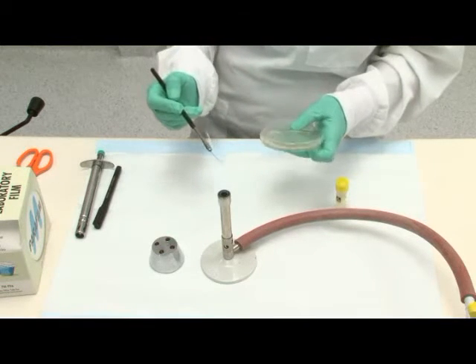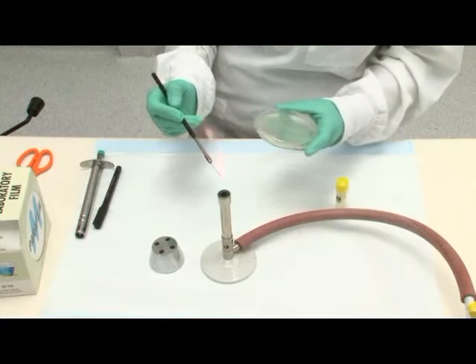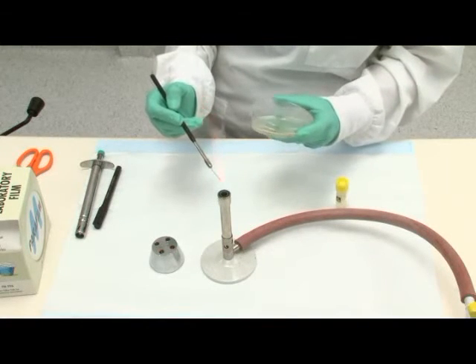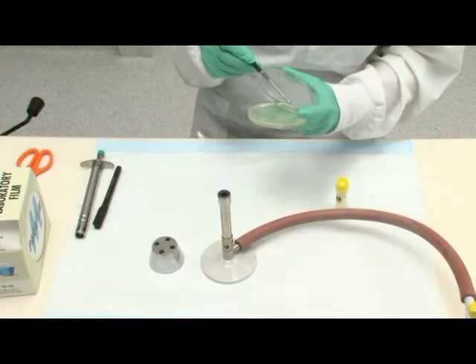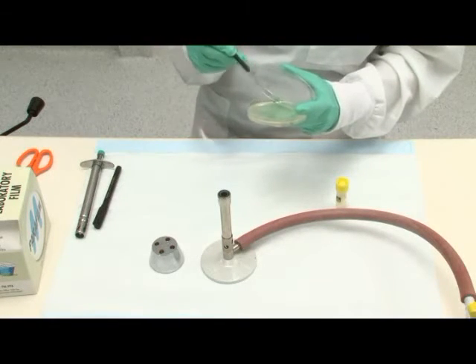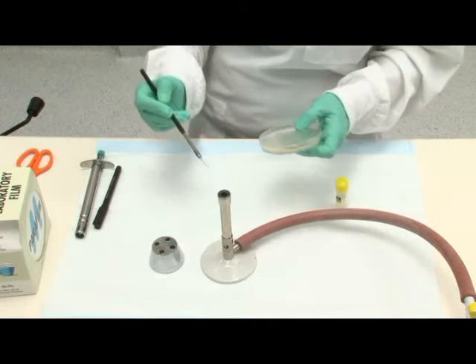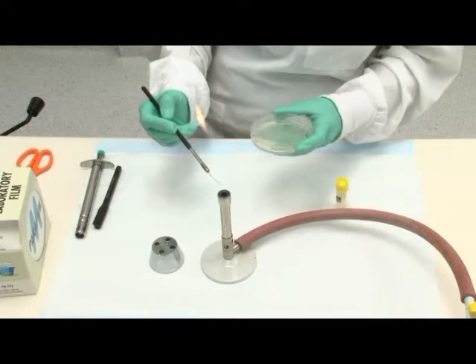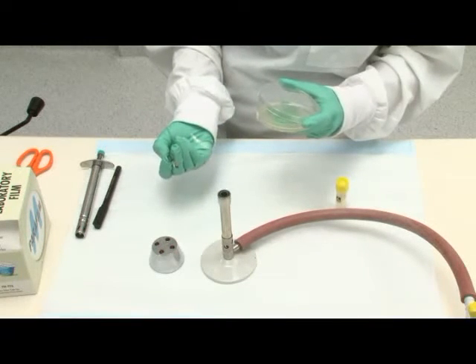Flame and cool your loop again. Streak the second quadrant by drawing 4 streaks through the first 4. Flame and cool your loop. Streak the third quadrant by drawing 4 streaks through the second 4.